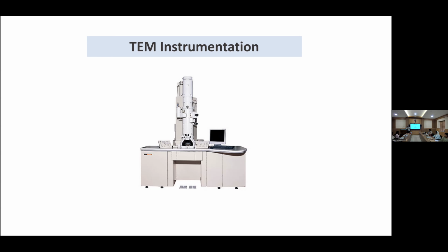I'm not much experienced with those high-end machines. So this is like common knowledge for me. It's possible to identify hydrogen atoms at that level, only my knowledge, because I have no experience with those high-end machines. In our lab, we have a 200 kV LaB6 type microscope. In that, we can go up to lattice fringe level. That's just a high resolution microscope. But this kind of work we can do with aberration corrected STEM or atomic resolution microscopes.